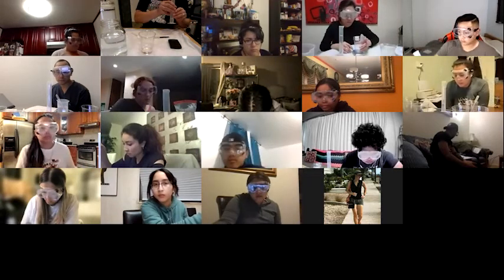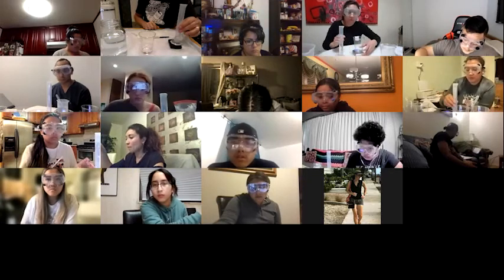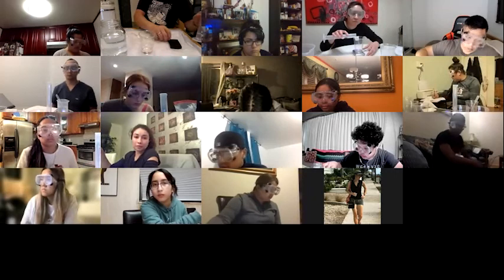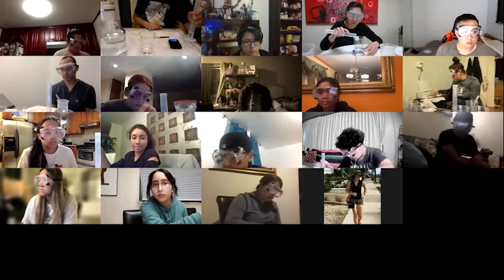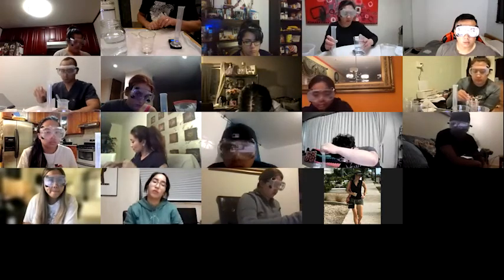Great job. So now I've got about 10 in there, 10.0. And measure the mass again.